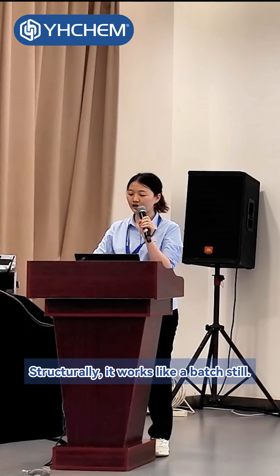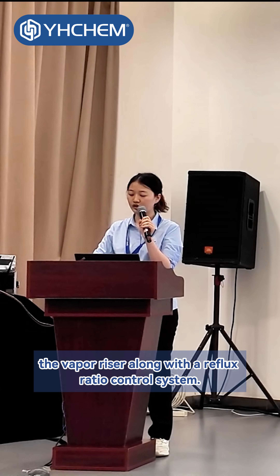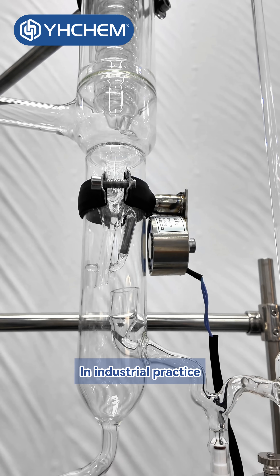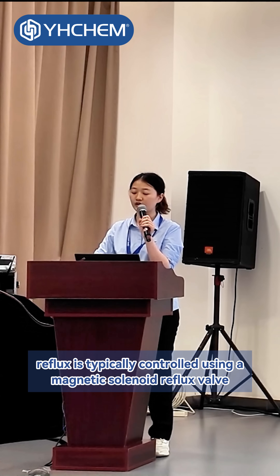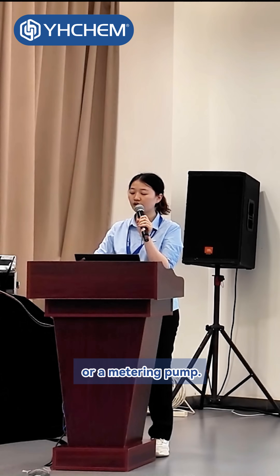Structurally, it works like a batch still. Here you have the rectifying column, and above it the vapor riser, along with a reflux ratio control system. In industrial practice, reflux is typically controlled using a magnetic solenoid reflux valve or a metering pump.